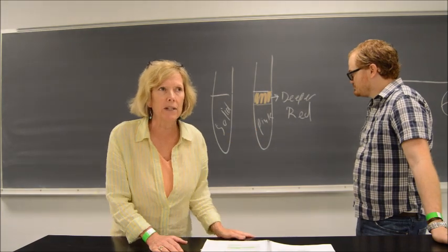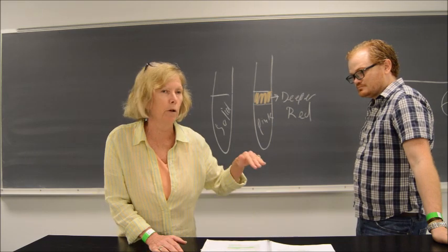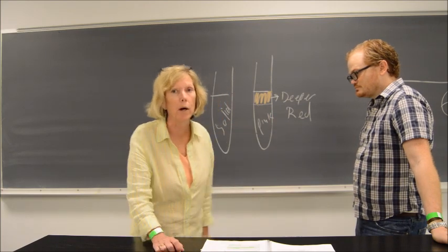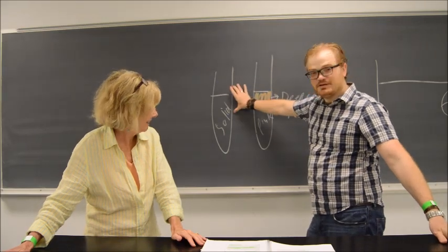And actually, if the test tube sets for like an hour or so, all of the Sudan 4 would move out of the water layer into the oil layer. And you would see this is totally clear, like water should be. Lipid positive, lipid negative. Exactly.